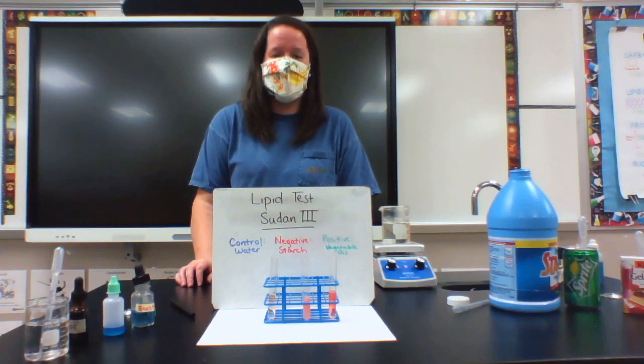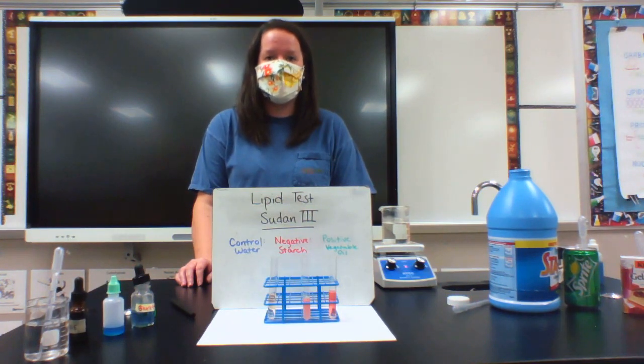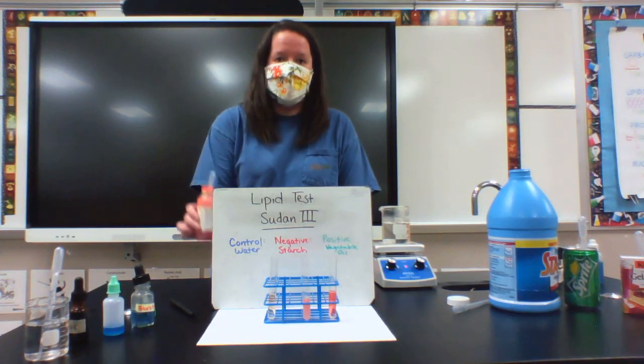Hey y'all, I'm Miss Busby and I'm going to show you about the different indicator tests that we can use to see which biomolecules are in a different solution. So our first test is the lipid test. We use the solution Sudan-3 to test for lipids.